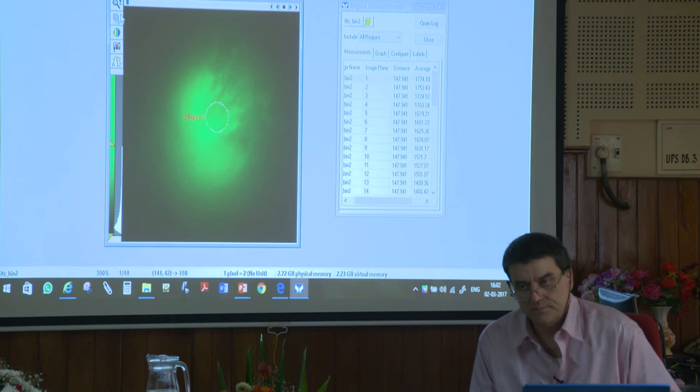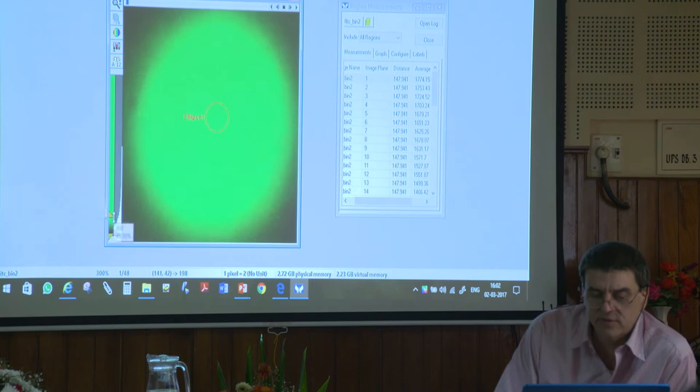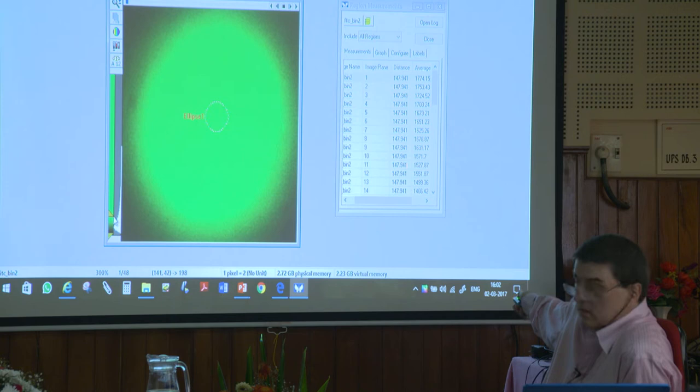The data, right? No matter what the data looks like, the pixel values don't change. So don't get fooled. It doesn't matter. If we do this, look at the intensity values. They're still the same, right? Nothing's changed because the data.